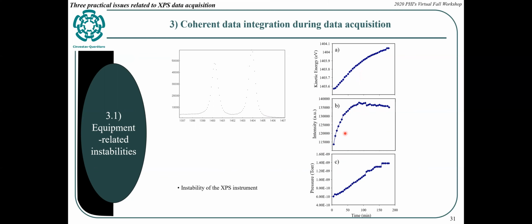We now wait at least 2 hours for the equipment to stabilize after turning it on. But anyway, there are changes. There are shifts due to the equipment.